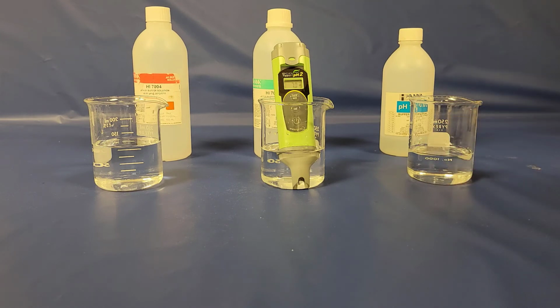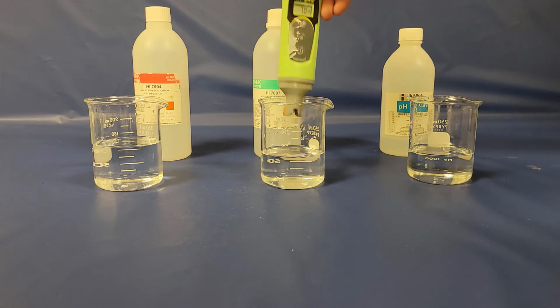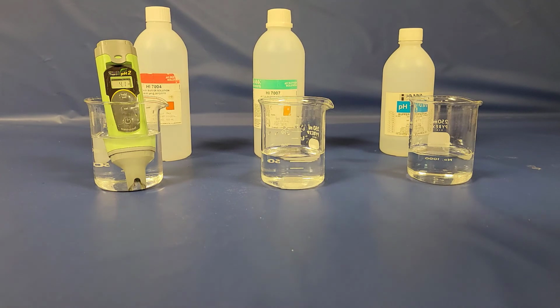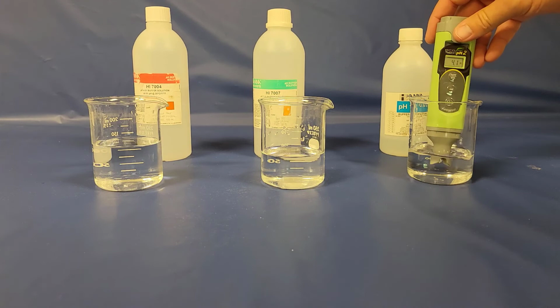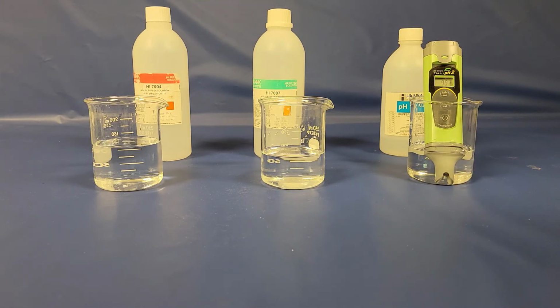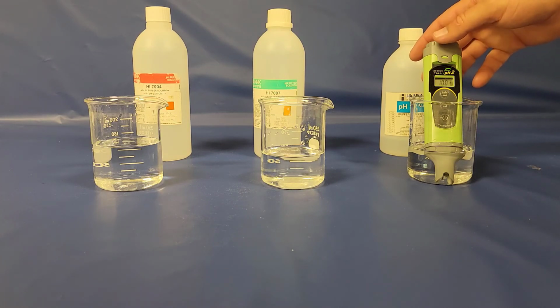So it's saying 7, right? You've got to give it a moment to get it dialed in. So there's 7. We'll go ahead and try it again with 4. There it is at 4. Dry that off and then bring it over here to 10 and see if we get a 10 reading as well. All right, so there it is, 10. So we now have our calibration of our sensor, so now we can use it to do the titration as well as use it for the travel time lab.